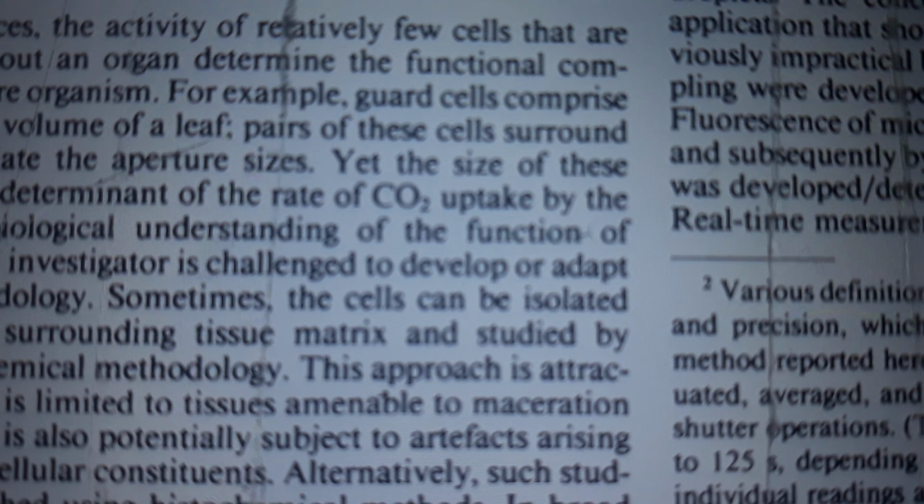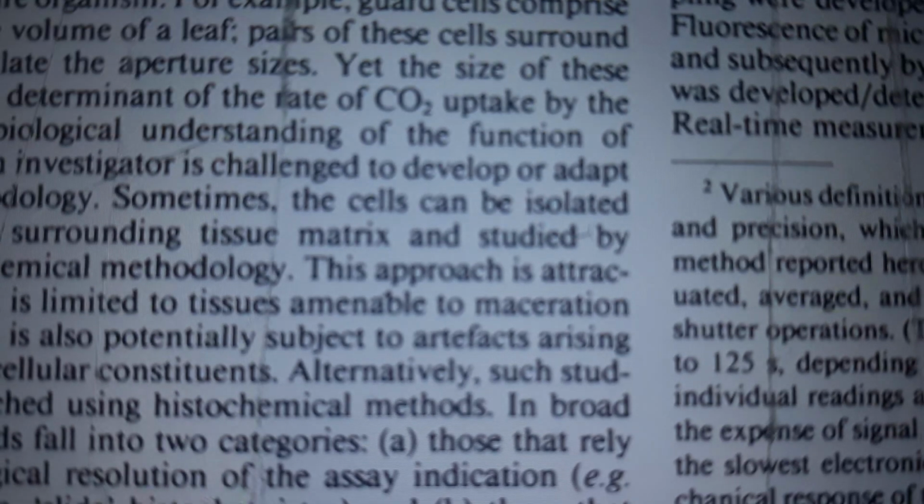Here we have a direct method for enzyme assays using natural substrate in solution with a time resolution of seconds and the measurement of activity in f-moles. The approach is based on computerized data acquisition and analysis of photometer signals resulting from NADPH fluorescence in microdroplets. The concepts themselves are not novel. It is the application that should make them amenable to experimentation.